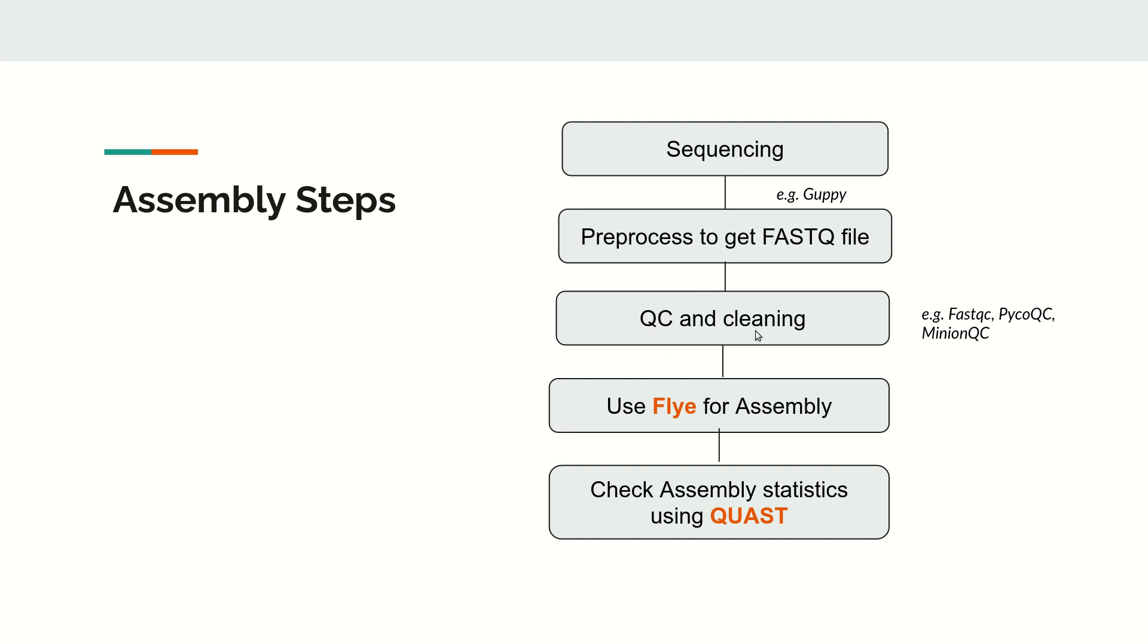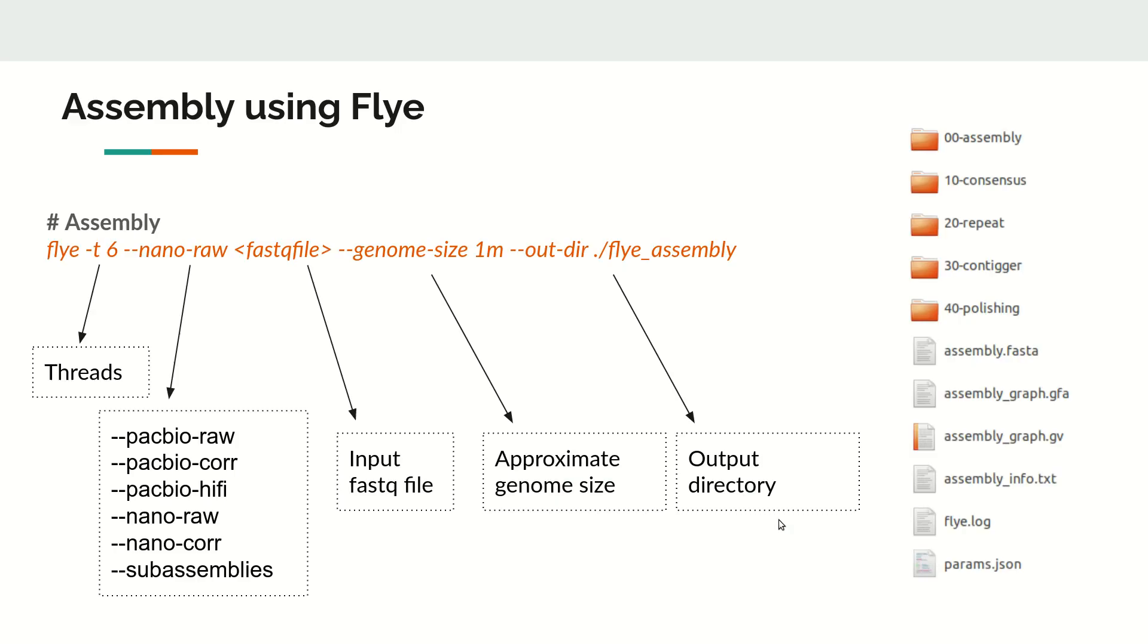After the Flye assembly process is finished, we can check the assembly statistics using QUAST as a tool.